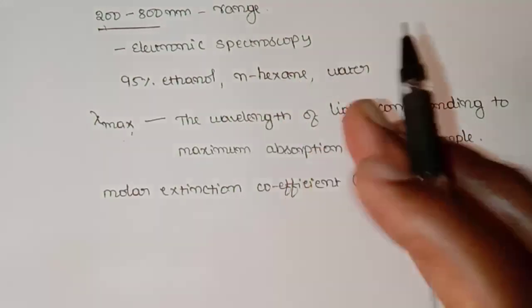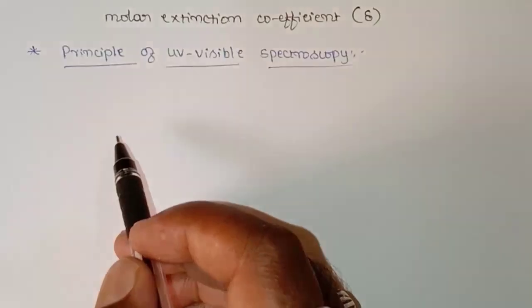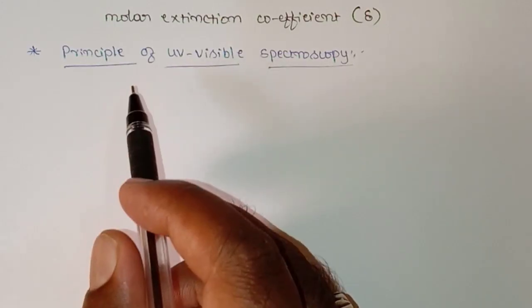Now we shall see the principle behind UV visible spectroscopy.